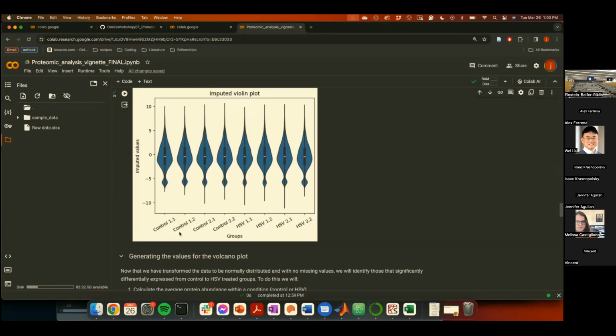I think theoretically, because the distribution does follow a normal distribution, the question was, should there be values from the data that are below the detection threshold that we've set as 2.5 times the standard deviation? I'm going to give you my response, and Simone can agree or disagree, but I think that, of course, there's a chance. Of course, it's a normal distribution. It could be, but we made it so that it is unlikely that there are going to be values below that because we've looked at the standard deviation. We've made it so that there shouldn't be that many values below that.